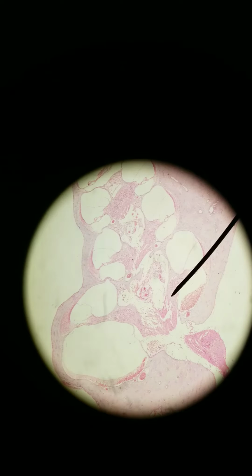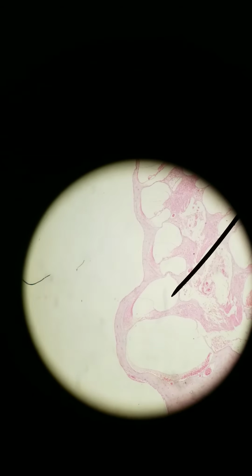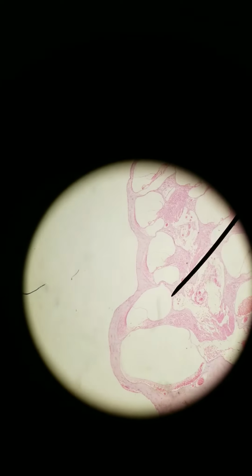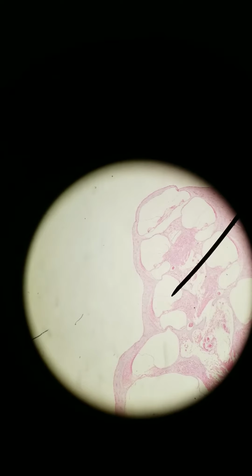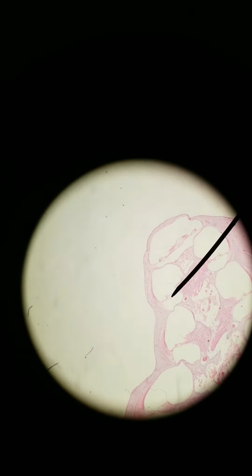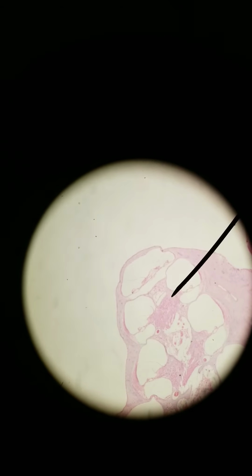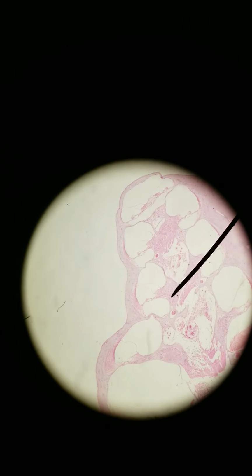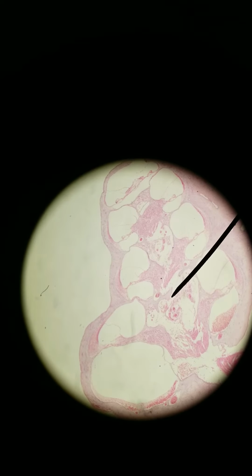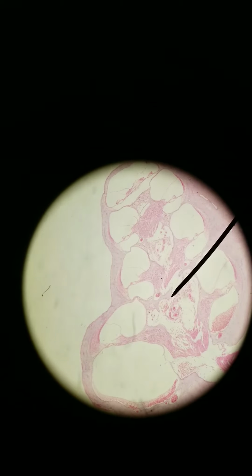We see a repeating pattern of these ducts. We see this large one, this small one here, and then a medium-sized one. They come in threes. 1, 2, 3, 1, 2, 3. So these ducts are, if you can imagine this, spirals. We're spiraling around and around like a snail. The cochlea looks like a snail.